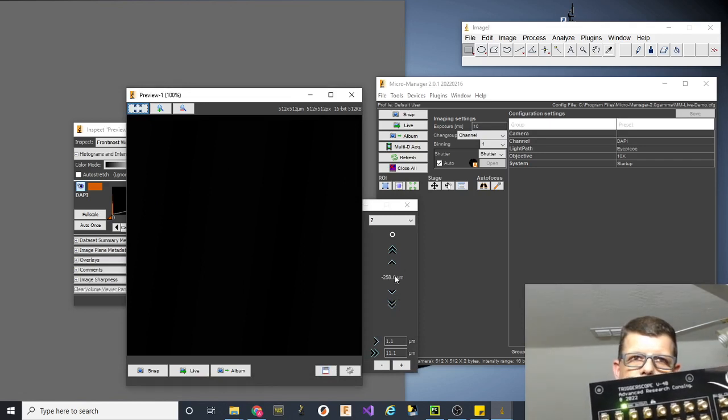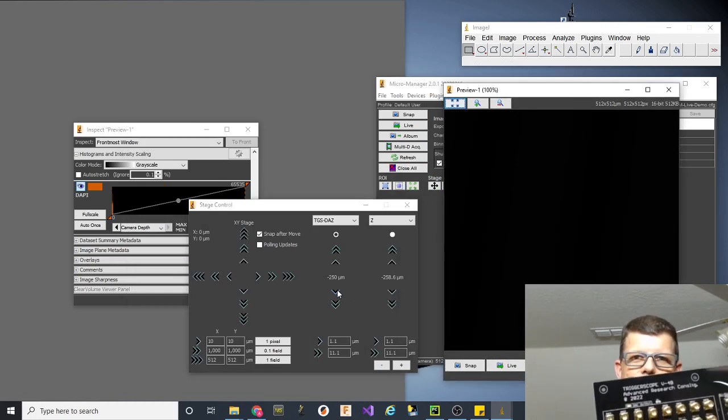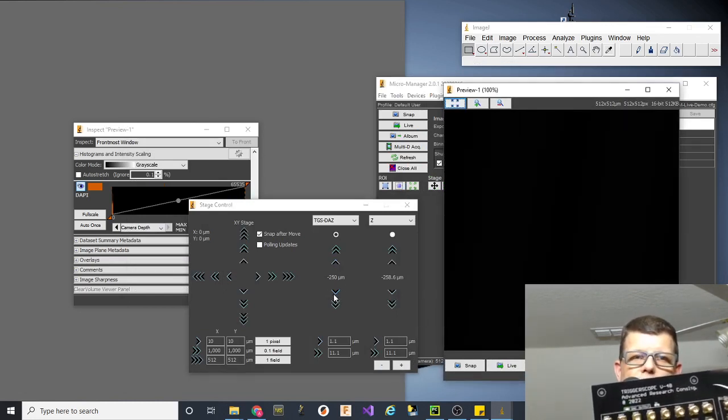Well, and it went below the minimum. Oh, that's because I'm using the wrong stage. There we go, and it turned the light off. So here we're outputting greater than 0. Here we're outputting 0. So that is indeed working, and that's great to see.